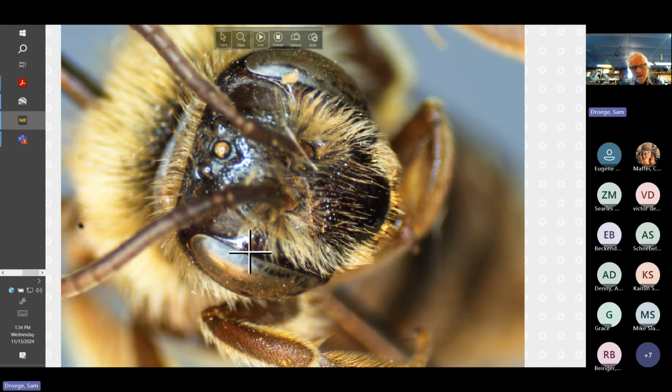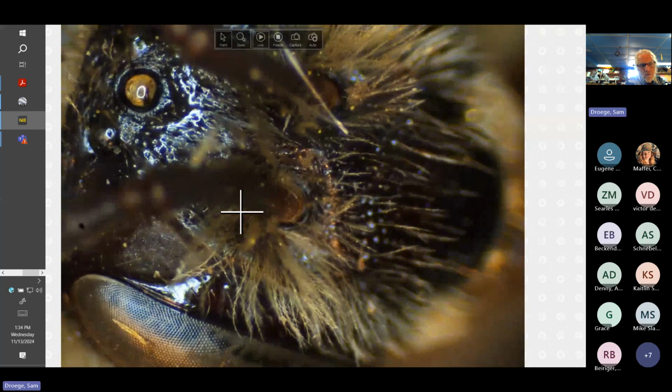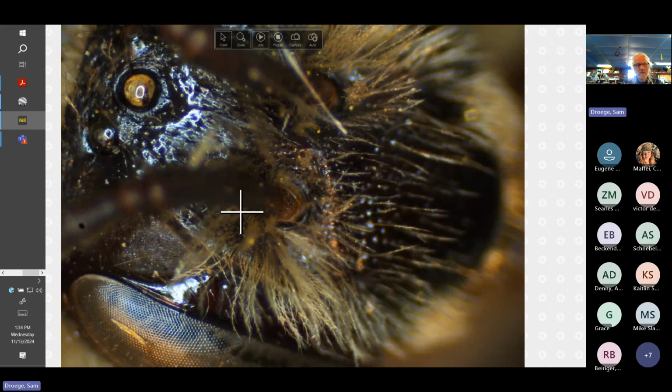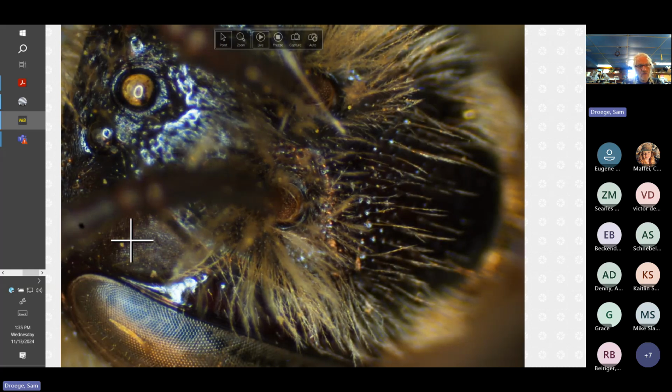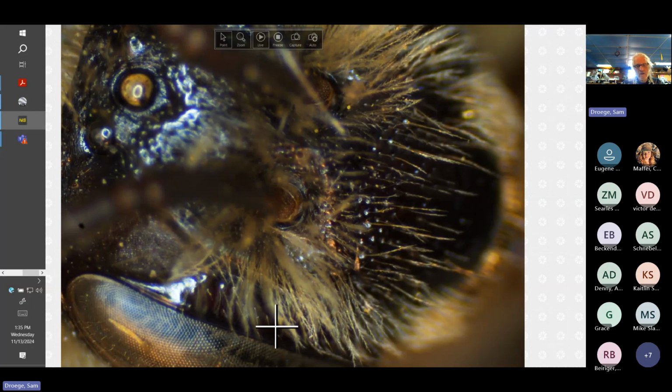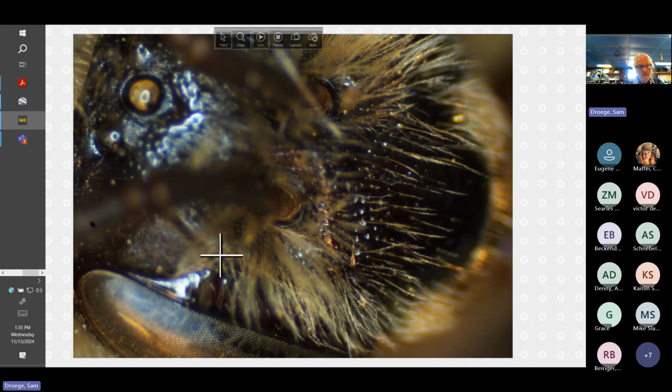And then, if we look on this specimen, let's zoom in a little bit more. We have the hair problem of the lower part, but I think we get the hint because it's so strongly defined. So here is the edge of the facial fovea. This is the whiter part up here, as per usual. And instead of just wandering along the border to the eye, you see that it bows out here. So it's actually leaving the wide area fairly far inland, and it's running in a very skinny way and runs back like this.